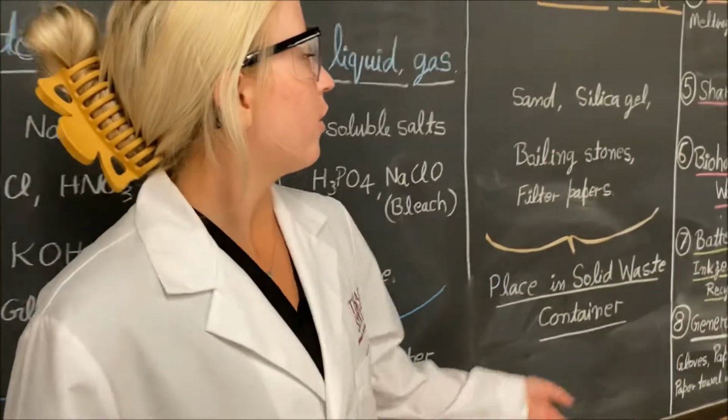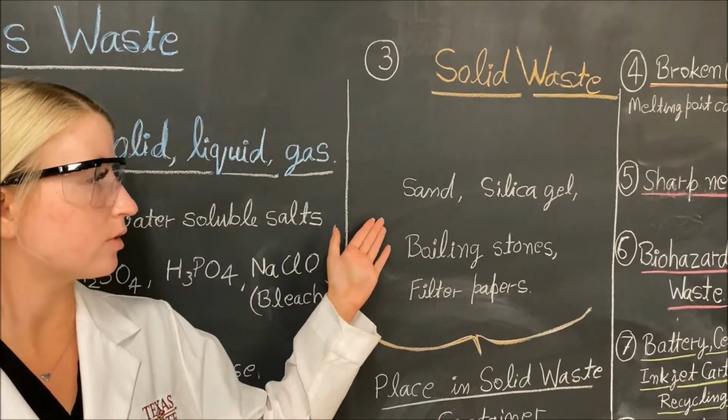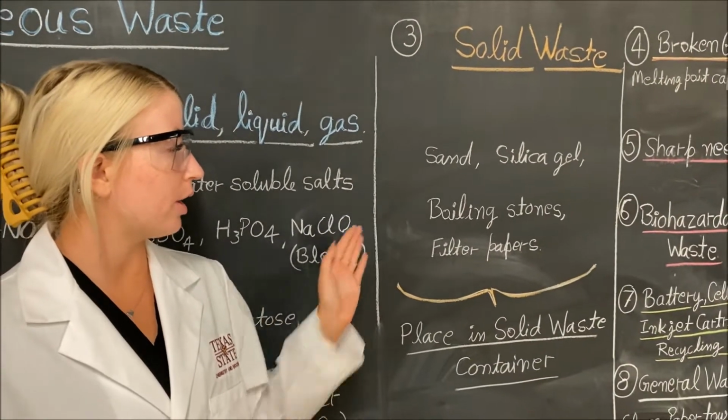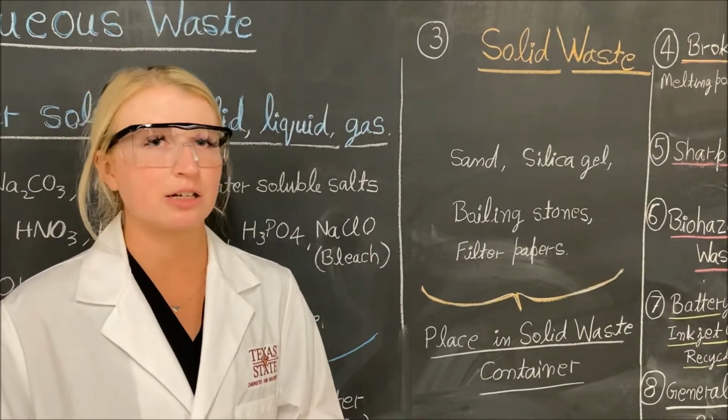And then our last section for your common waste is solid waste, such as sand, silica gel, boiling stones, and filter papers, and those you'll just place into the solid waste container.